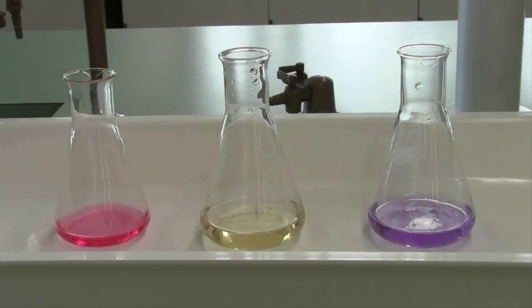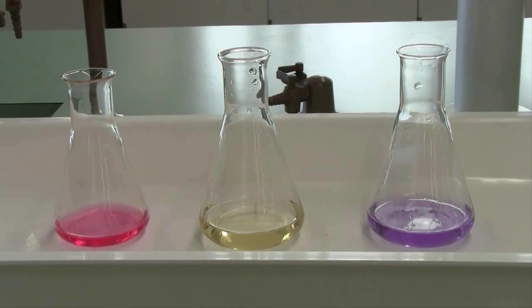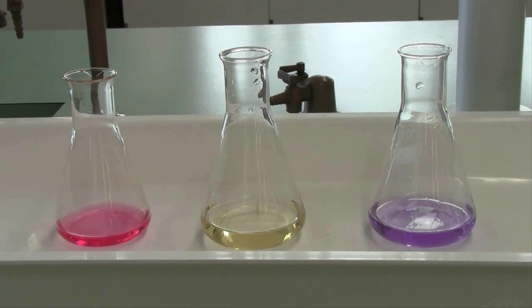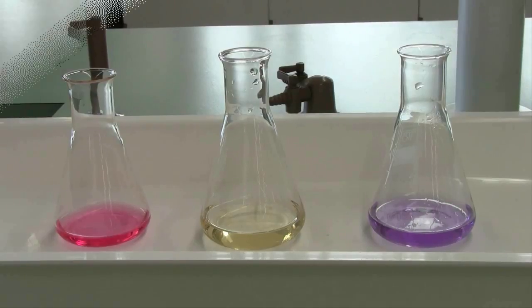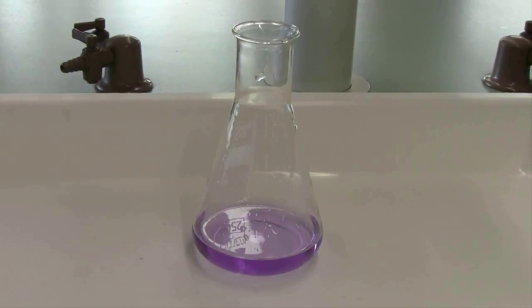This solution will start off a pink color, it will turn yellow when you are close to the end, and you'll have reached the endpoint of this titration when you see a permanent purple color through solution that remains for at least 10 seconds.